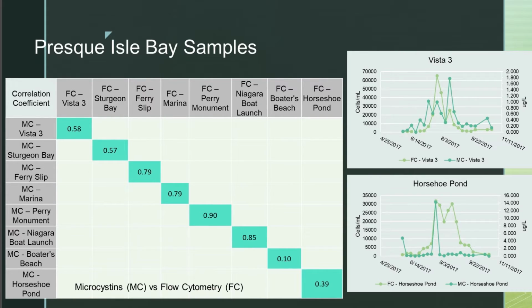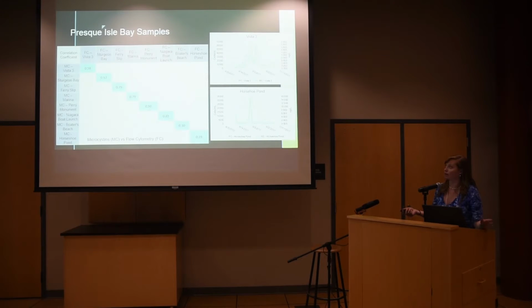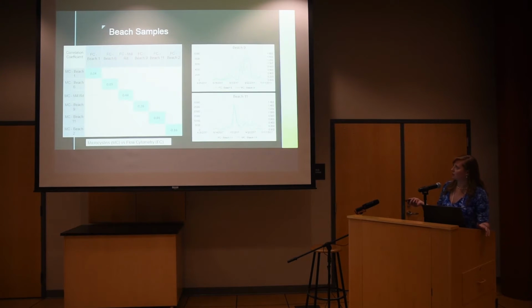And I think the reason for that may be because we actually collect that sample almost right in the morning, so at 7 a.m. or maybe 20 minutes after. And as Dr. Diz said earlier, they do have those gas vesicles where they can propel themselves up for the sunlight. So I'm thinking maybe that we have to change our methodology there so that we're getting sunlight exposure when we take that sample.